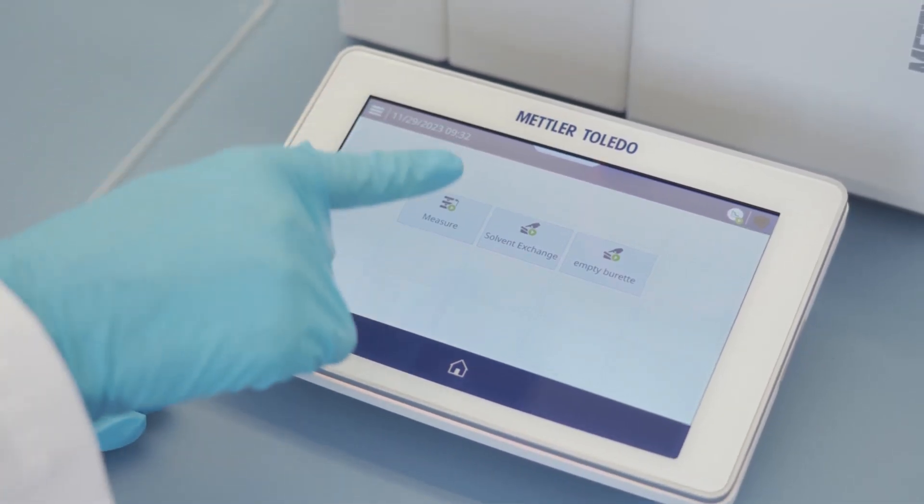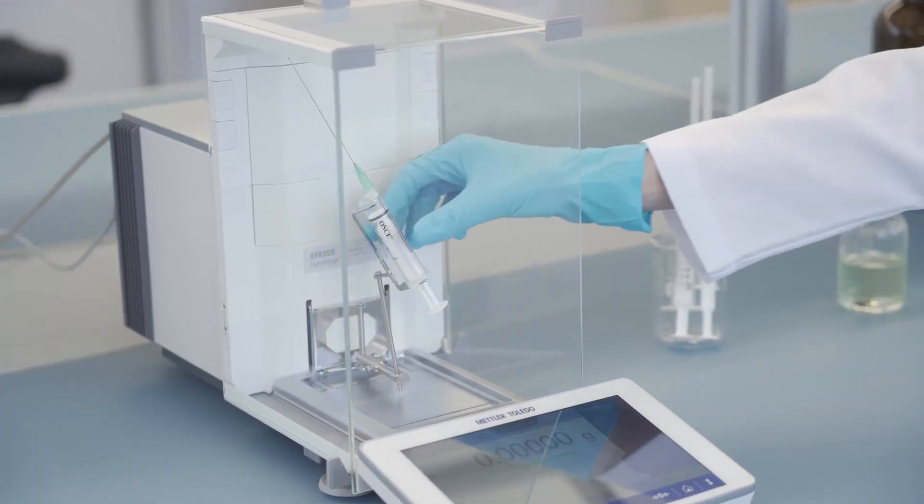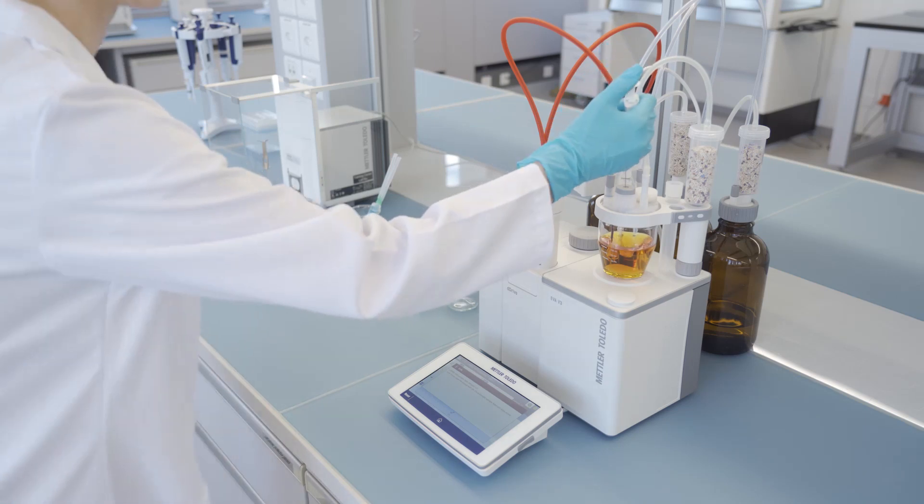With its intuitive interface, you can start your analysis with just one click. Now, just add your sample into the cell, and the measurement will start automatically.